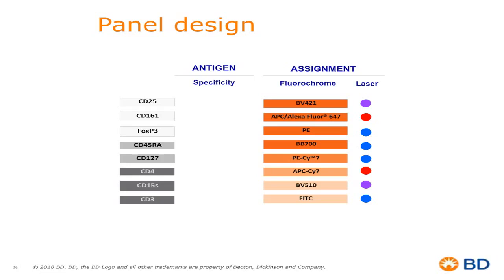And so they're a darker gray. I have secondary antigens that are also well characterized with relatively high density per cell, but their expression pattern is often a continuum. An example would be CD45RA and CD127. And then we have the tertiary antigens that are expressed at low levels, and often you can also find things like transcription factors and things that are a little harder to resolve that will be put into that bucket.